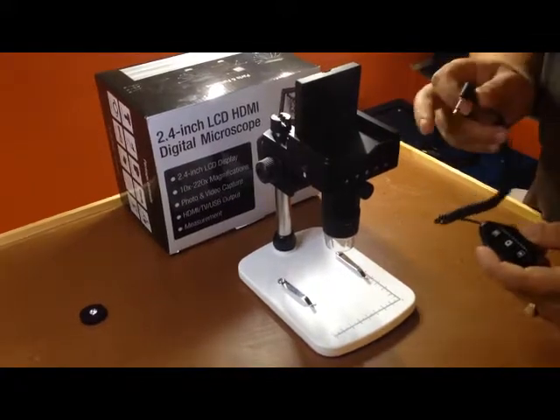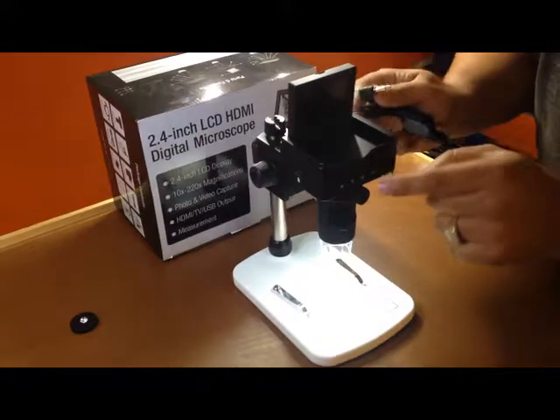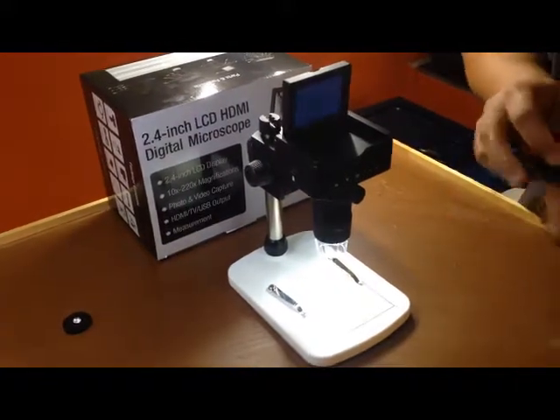Alternatively, should you wish to take pictures without the remote, you could just use the buttons, as you can see, on the unit itself.